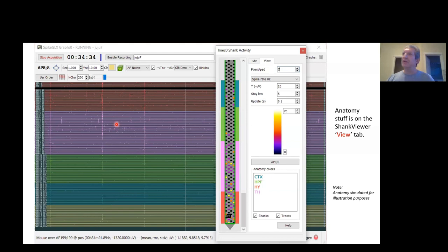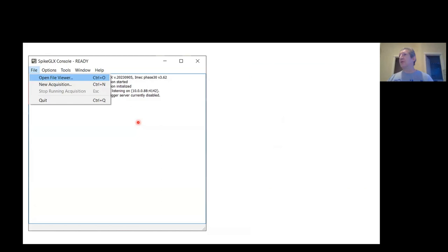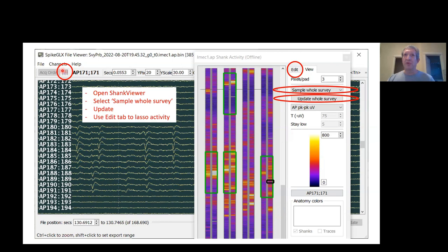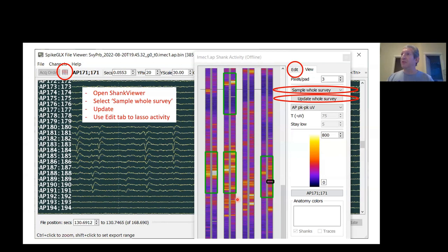I want to show you a couple things on the offline file viewer. You go to File and choose Open, and you get a file viewer that you can use to open any existing run. You can see your traces, you can filter them, apply a bunch of operations, find noisy bad channels. If you scroll in time, first of all, if you open up the shank viewer, and then if you're scrolling in time, you'll see activity wherever you are in the file on the shank viewer. This is another opportunity to go to the Edit tab of the shank viewer, and you can lay down selection boxes on top of the activity that you see.